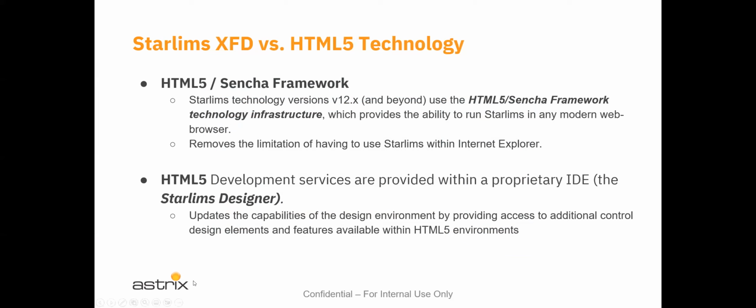It removes the limitation of having to use STARLIMS with Internet Explorer. They also have the HTML5 development services provided with the proprietary IDE, that's STARLIMS Designer. We're going to be looking at that. And it updates the capabilities of the design environment by providing additional controls and additional elements, and it gives it a completely new look and feel. It really does look nice.